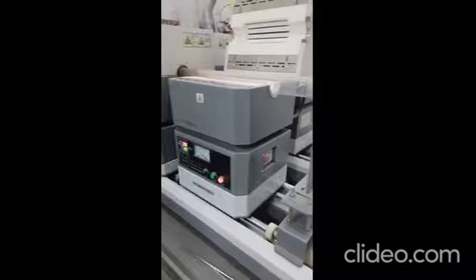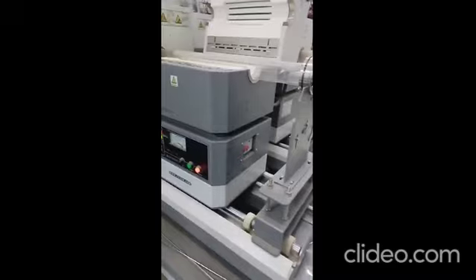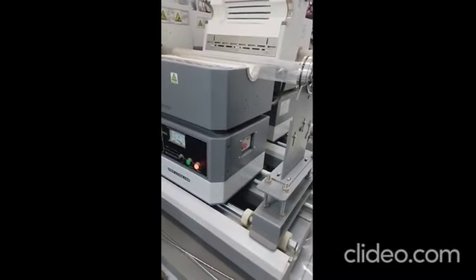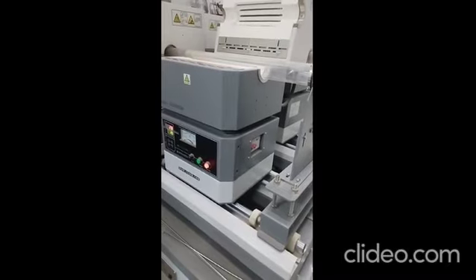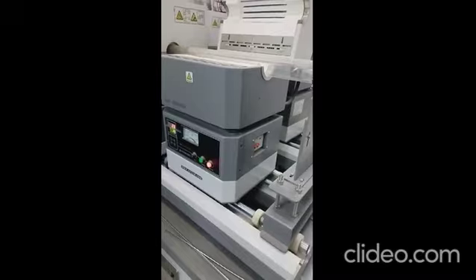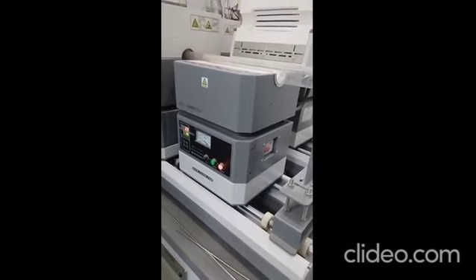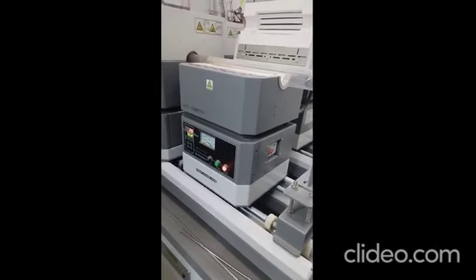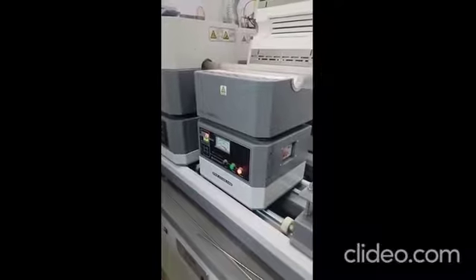And then we need to transfer this Mo2C. We need to remove the copper.